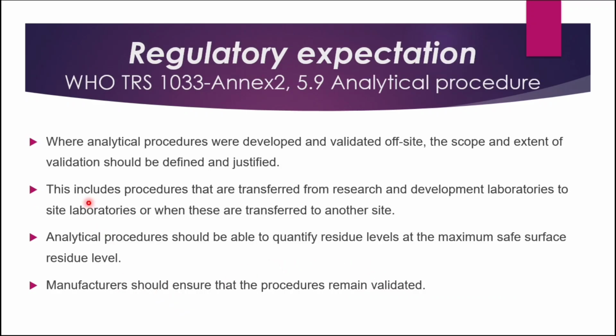Now, other regulatory expectations include where analytical procedures were developed and validated offsite, the scope and extent of validation should be defined and justified. If you have developed the method offsite, then to what extent the method has to be validated at the site where you have sent it, that can be defined and justified. This includes procedures that are transferred from the research and development lab, R&D lab, to the site laboratory or from one site to another site.